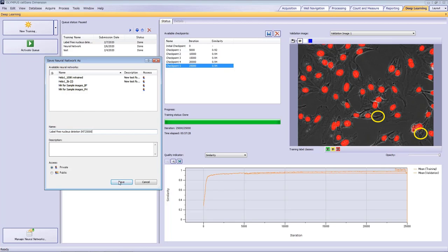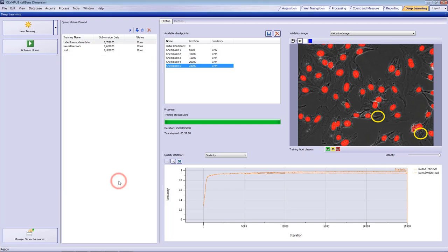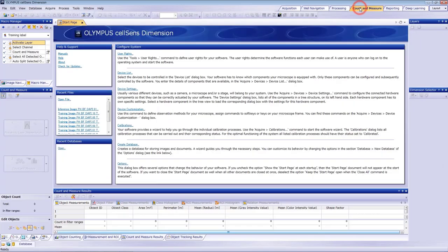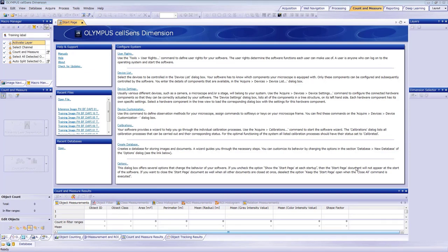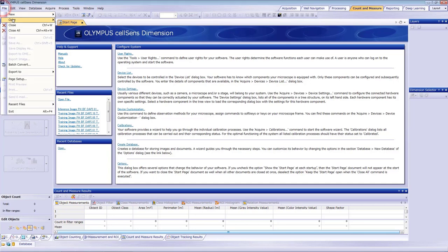The neural network training is complete. Go to the count and measure layout tab to apply the neural network to other images. The images we're going to use in this example are available in the installer guide. Open two of the images.